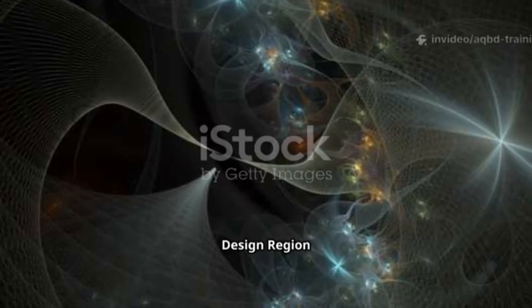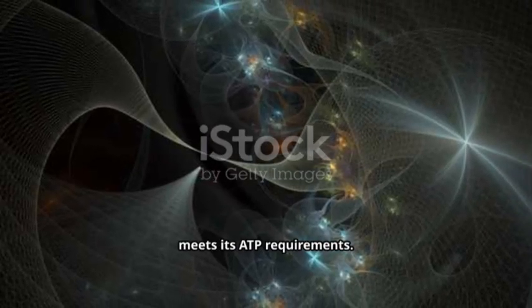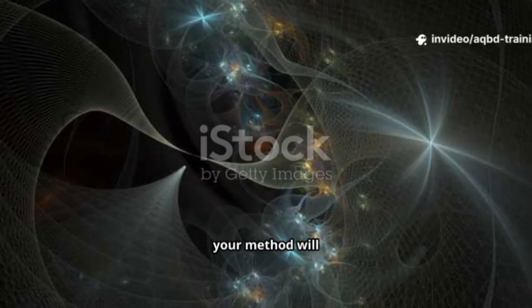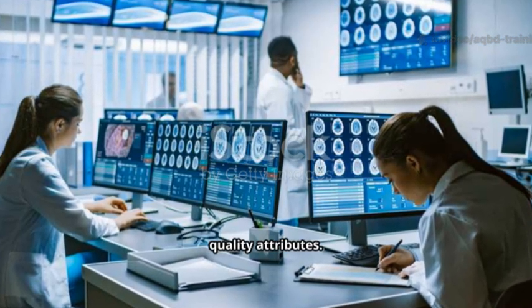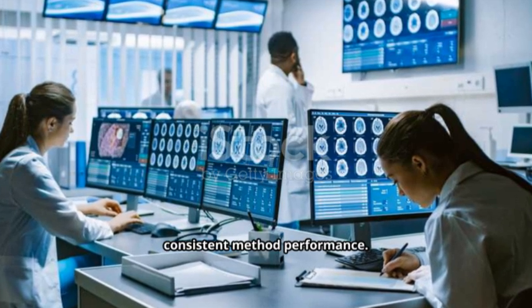The method Operable Design Region represents the multi-dimensional space where the method consistently meets its ATP requirements. Think of it as the sweet spot where your method will work reliably. The MODR is defined by overlaying the acceptable ranges for all critical quality attributes. Operating within the MODR ensures consistent method performance.